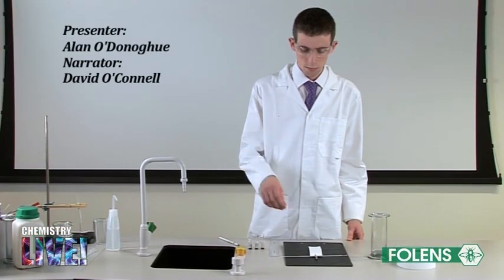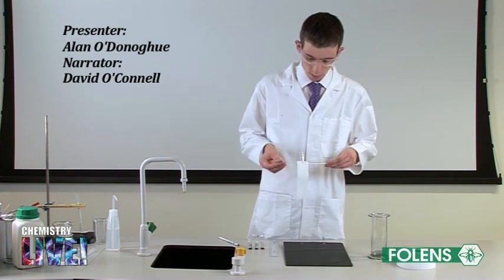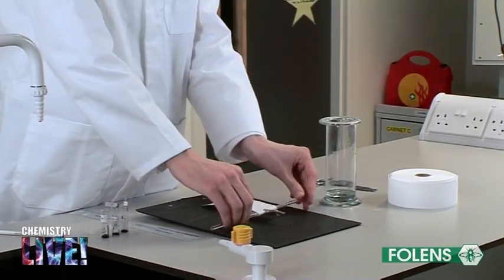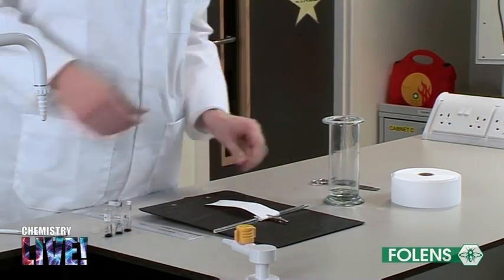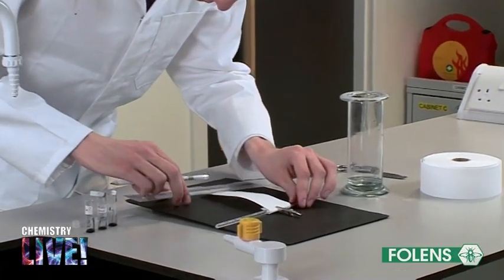The piece of chromatography paper shown has been cut to fit the gas jar. Try to avoid handling the paper a lot, as the oils from your hands can affect the results. Using a pencil, draw a faint line about 2cm from the bottom of the paper.